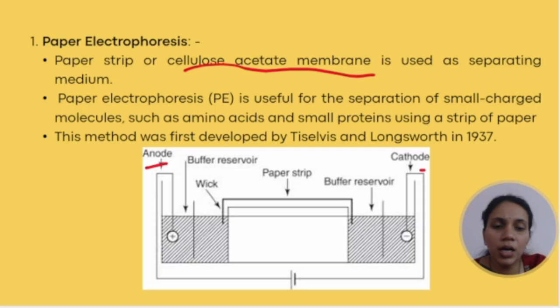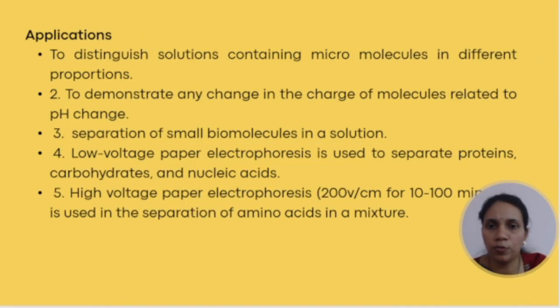So coming to the application of this particular paper electrophoresis. First of all, it is used for distinguishing solutions which contain micromolecules in different proportions. Next, to understand the change in charge of the molecules related to pH change. So how it is affecting.